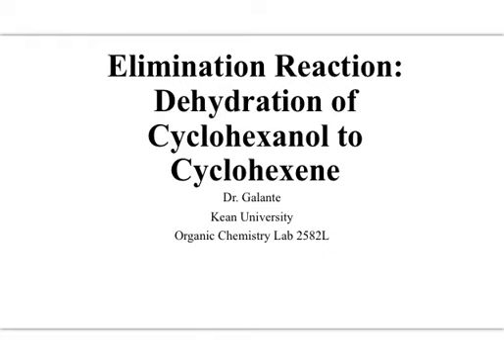Welcome to this week's lab. In this lab, we're doing an elimination reaction, or the dehydration of cyclohexanol to cyclohexene.